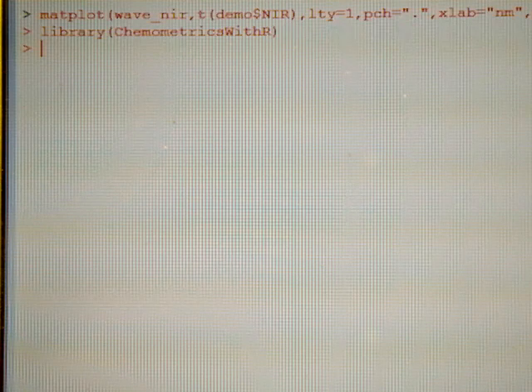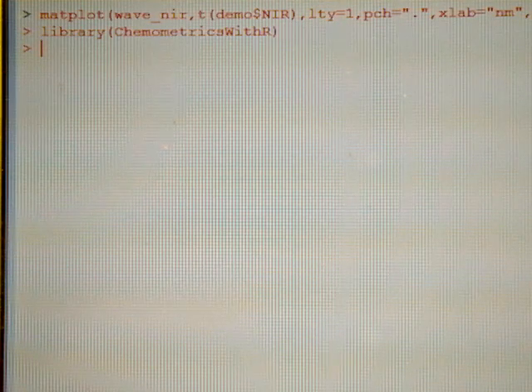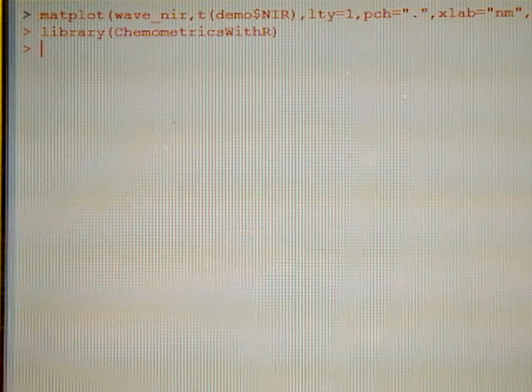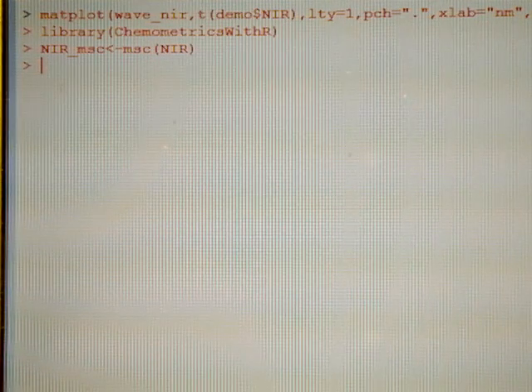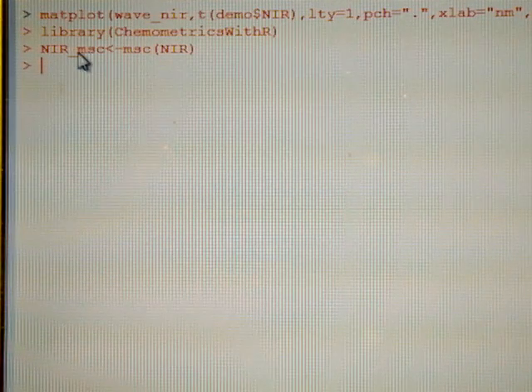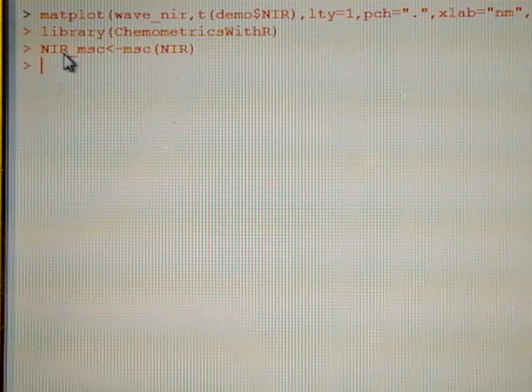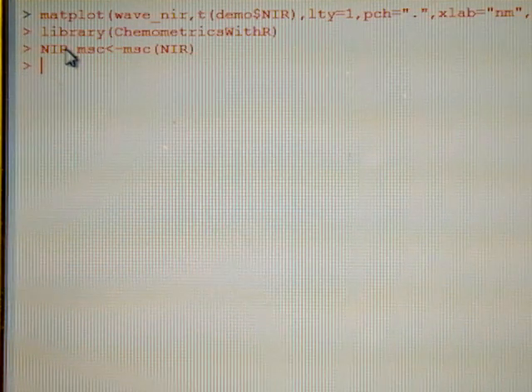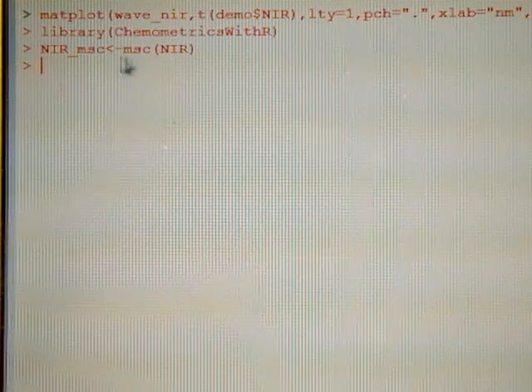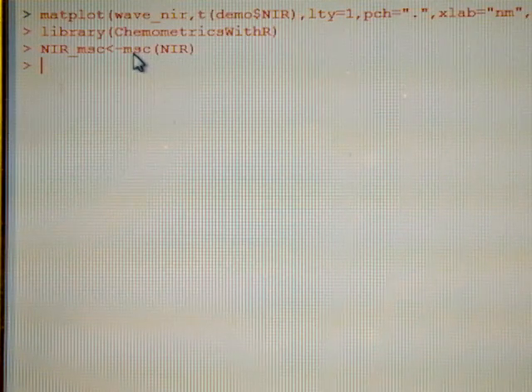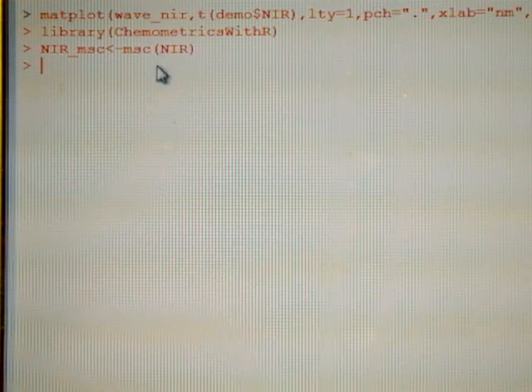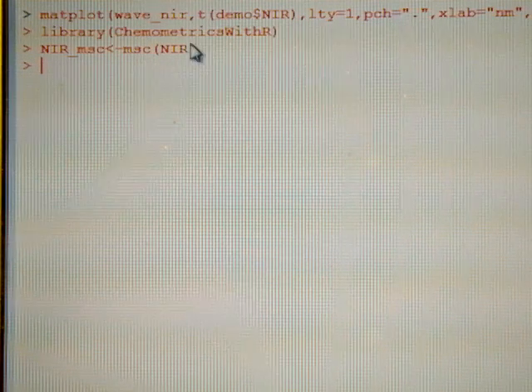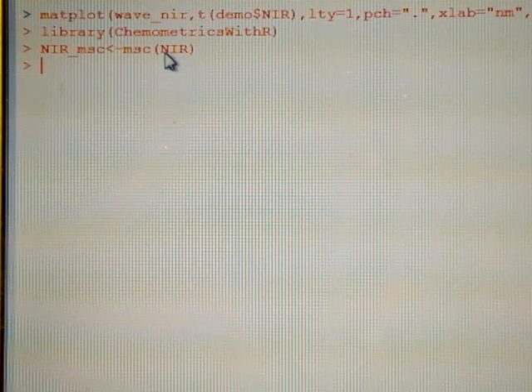So let's apply a treatment called Multiple Scatter Correction, and it is quite easy. Let's give the name to the new spectra, just in the near infrared area. We are only to work with this part of the spectra, and only write MSC and the name of the part of the near infrared spectra, NIR.